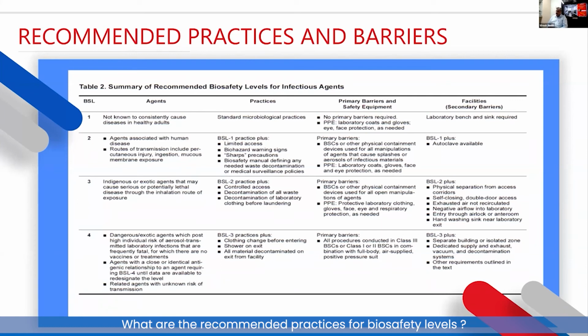When it comes to treating a BSL-3 and a BSL-4 facility, it is always ideal to make sure that the BSL-3 facility follows a lot of the secondary barriers that we insist on for BSL-4. The reason being that we are dealing with exotic and dangerous microorganisms, even at BSL-3 levels at times, and it is ideal not to compromise on some of these secondary barrier systems.